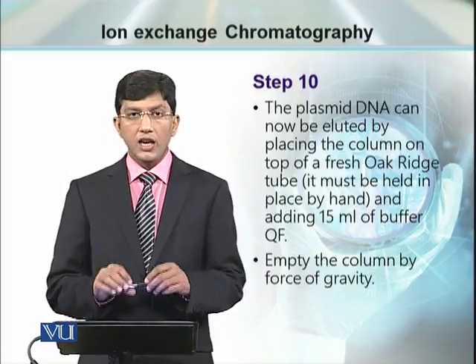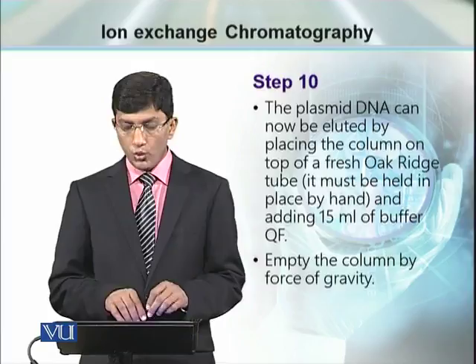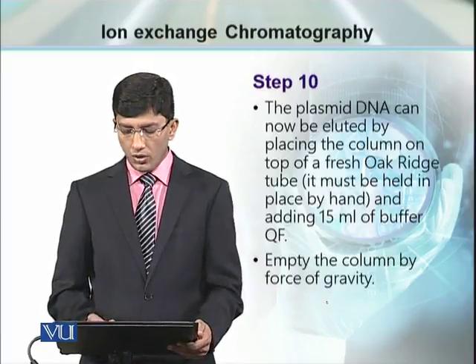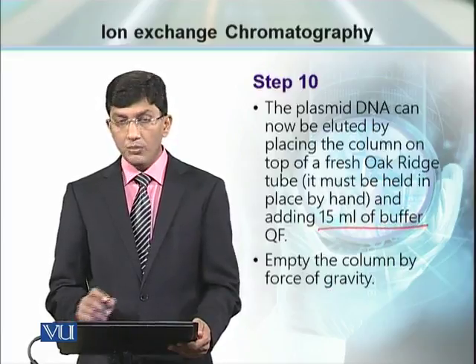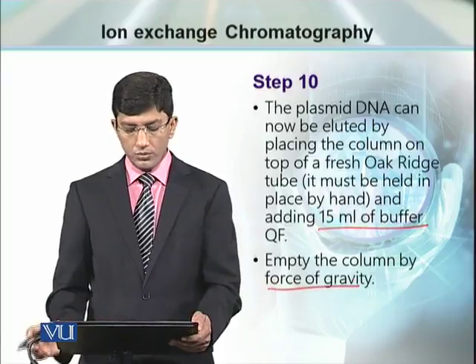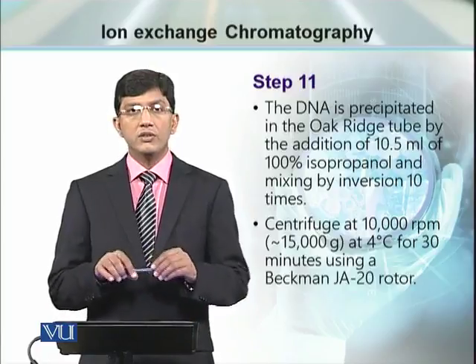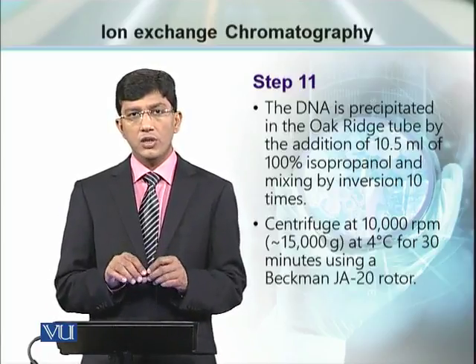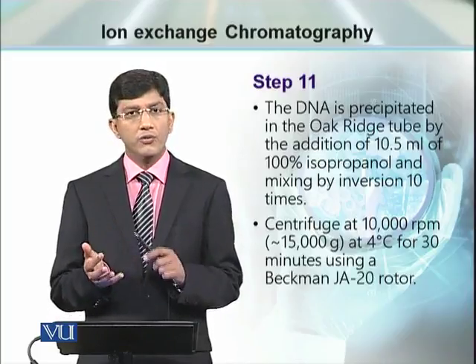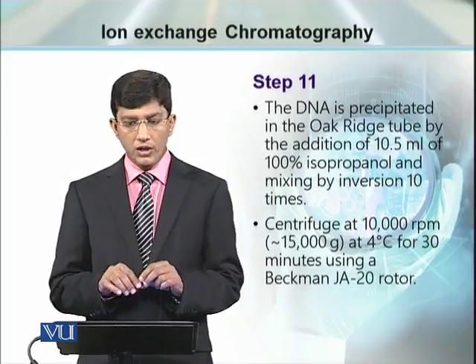Now, the plasmid DNA at this stage can be eluted using the buffer QF. The QF buffer, the elution buffer, is added in the column in a volume of 15 milliliter and let it pass through the column using the force of gravity. Once the plasmid DNA is eluted, it is in the tube and it can be processed further for its precipitation and purification using the method which you already know.